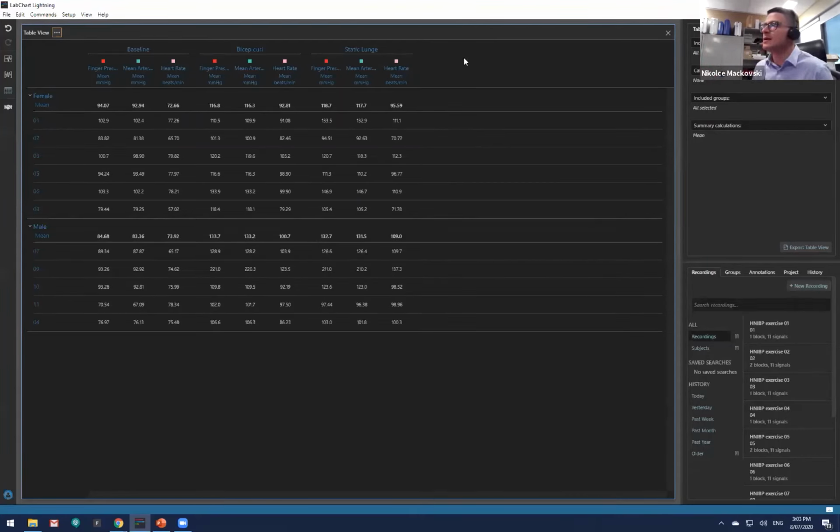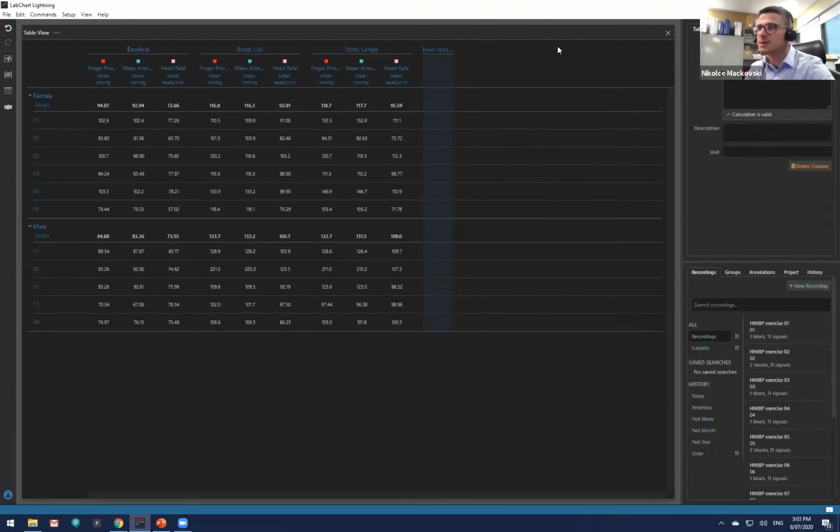So what I'm going to do here is, once again, by pressing my 3 dots, I'm going to come up with my calculated channels. By clicking on here, I can go to create column. And by going create column, what this is going to do is only calculate based off the regions, but it's only going to look at the summary data. So the data here only on this row. Okay. So remember, this row is the summary of all my data here. So this can be your mean, it can be your standard deviation, etc. Like I mentioned before, you can provide different calculations here, but let's just stick to mean as it's the simplest.